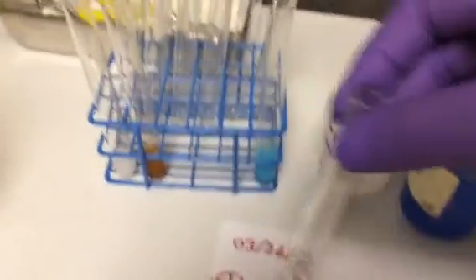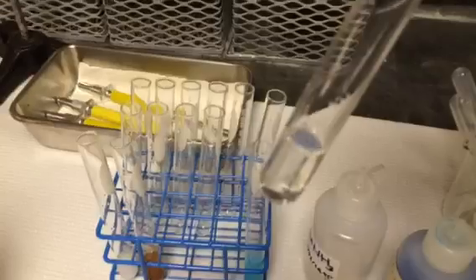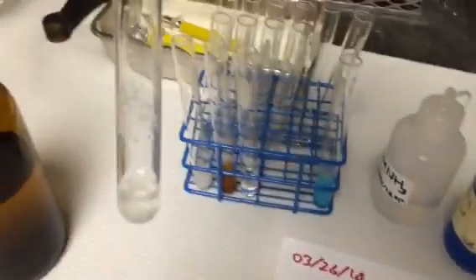And the third, which is sodium carbonate plus hydrochloric acid. Remember, this one produced a lot of gas and a heating sound. Same thing with the solid. And that's what I got.